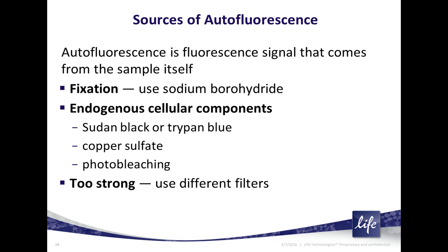If the autofluorescence is from your fixation technique, you can do a sodium borohydride treatment. Just very briefly, sodium borohydride is a component you can buy from chemical companies like Sigma. You'll make it extremely fresh, so you have powder in tubes, and after you've done your permeabilization, but before you do any blocking, you would wash it 3 times, 5 to 10 minutes in a 1 mg per ml sodium borohydride solution in PBS.